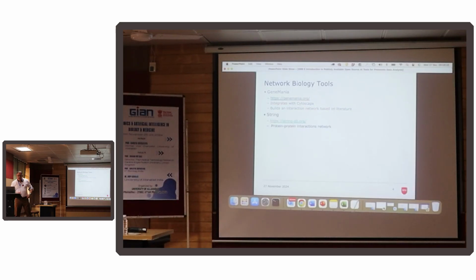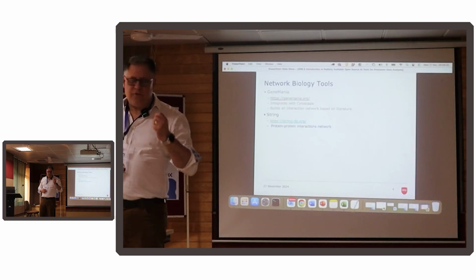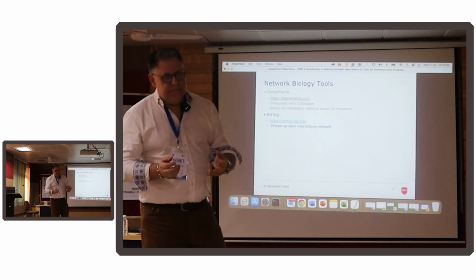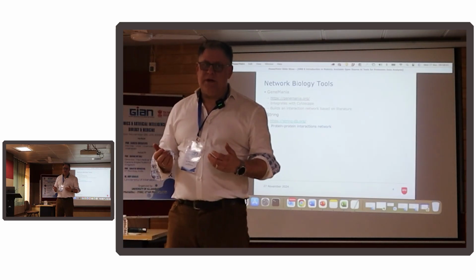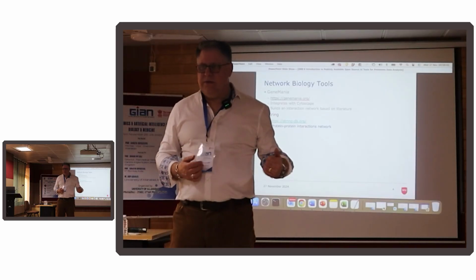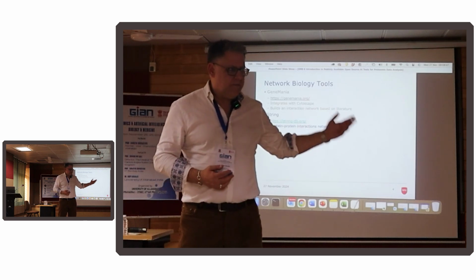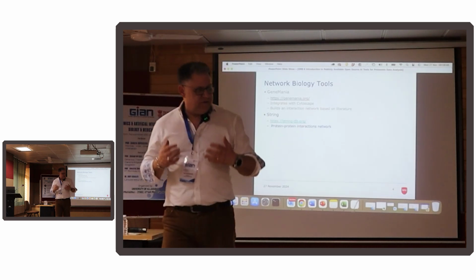Then another one, and this is very much protein focused. STRING is about protein-protein interactions. That's important for biology and for drug discovery. If you're looking at proteins, you want to see how they interact in a network, and it's all about differential binding. It's about energetics and so on, so forth.